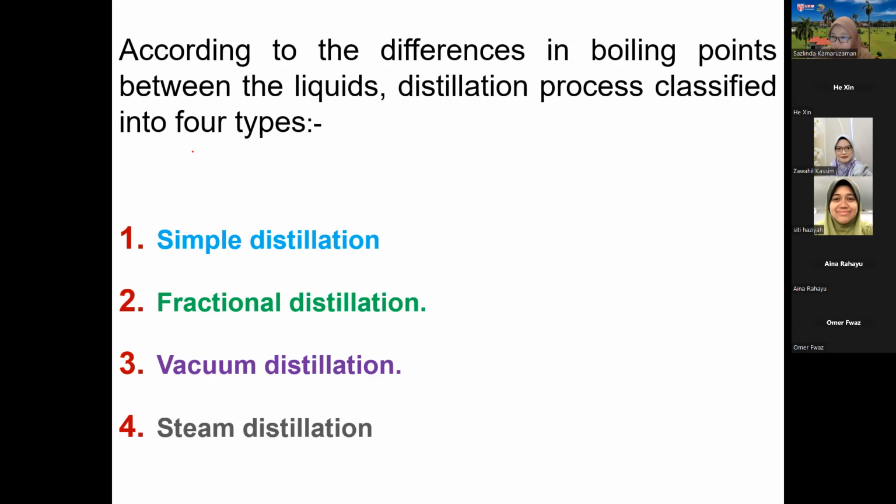Because this is a revision and all of us already know about this, I will just do some revision related to this topic. I give the lecture to make sure that you remember all the types of distillation. So we go for the simple distillation.